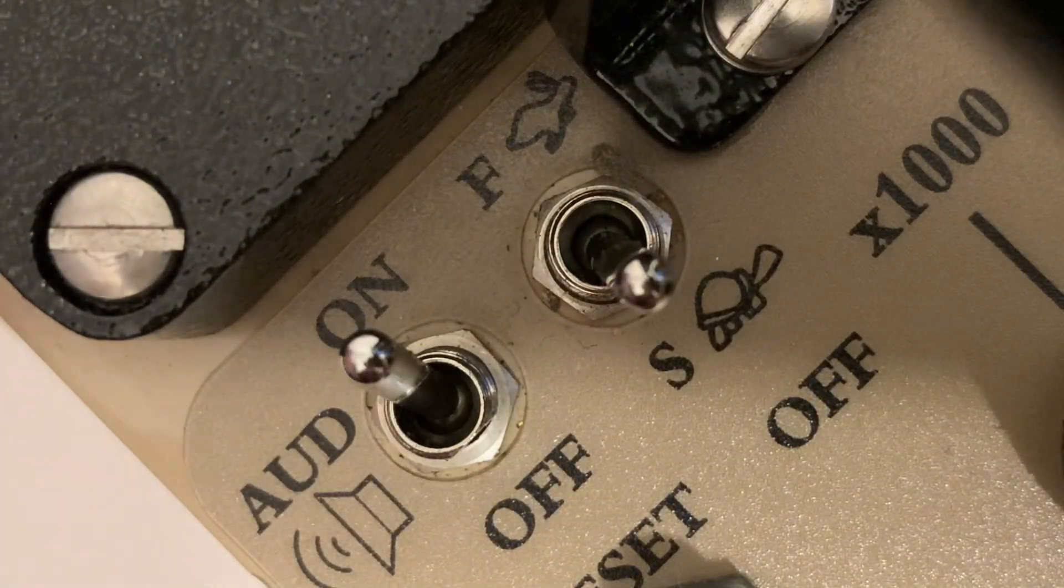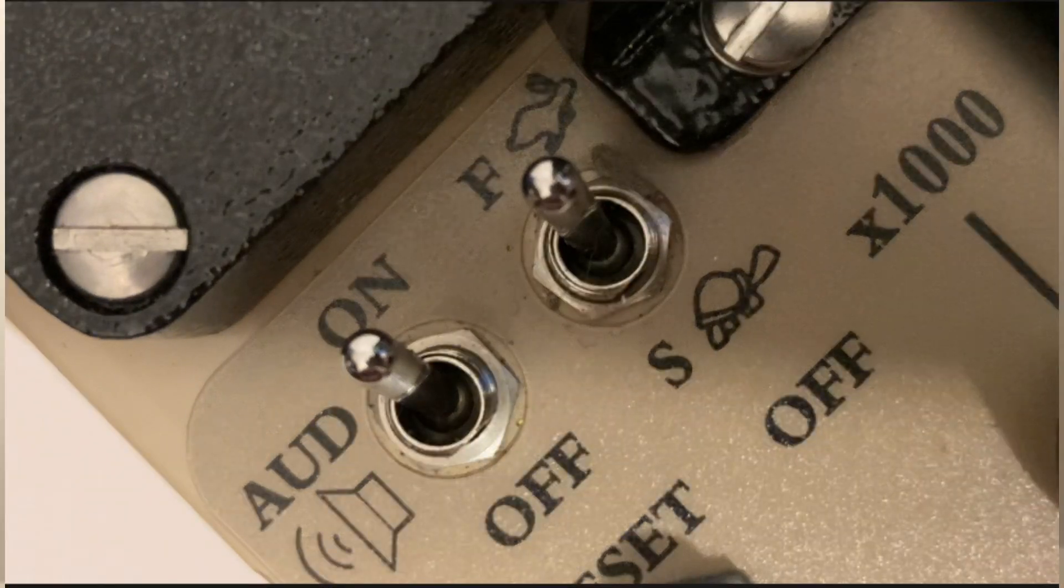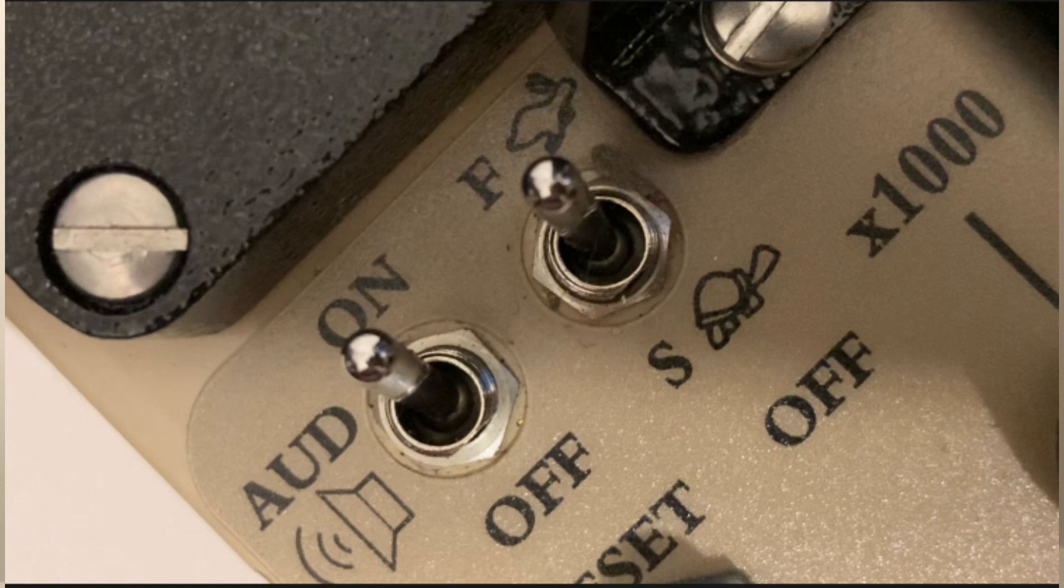Next to this, there is a switch labeled FS. You will see an image of a hare and also a turtle. This is the response time of the unit. In the F position, or fast, the needle will have a time resolution of 4 seconds. In S, or slow, the time resolution will be 22 seconds.